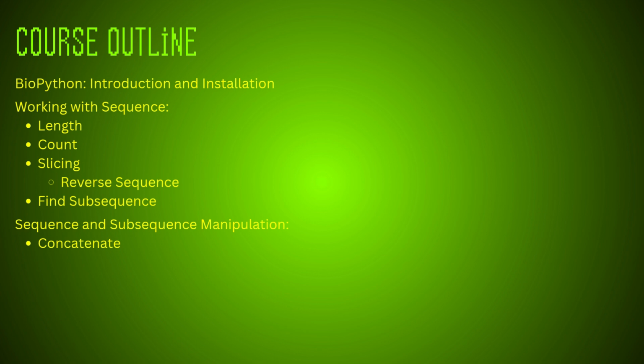Then, we'll explore how to find subsequences within larger sequences, a key step in many biological analyses. Finally, we'll look into sequence and subsequence manipulation, focusing on concatenation, which allows us to combine sequences efficiently. Let's begin our journey into the world of biological data processing with Python.